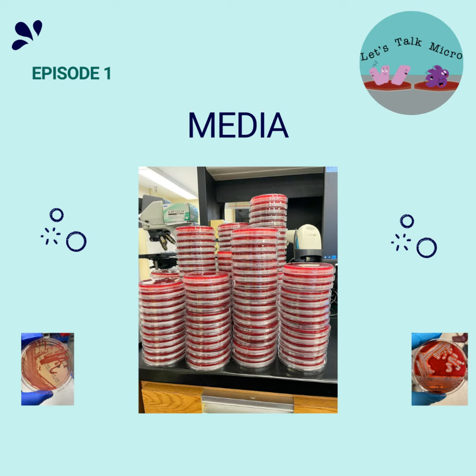Maybe some of you micro enthusiasts are saying, well, if I put Pasteurella aerogenes, it will grow. And for that, you will be right. But overall, the other Pasteurellas, like Pasteurella canis and Pasteurella multocida, are not going to grow in MacConkey. Pasteurella aerogenes is an exception, and I have a great story about Pasteurella aerogenes.